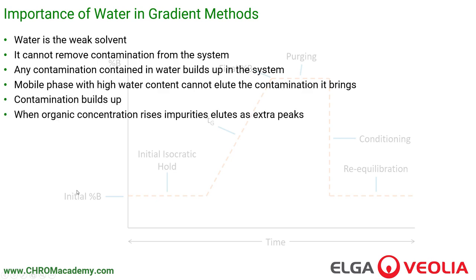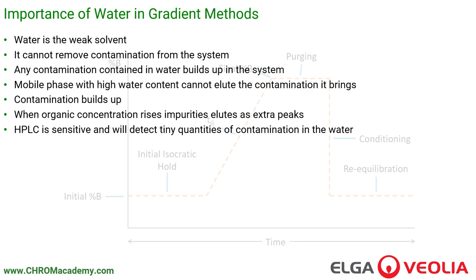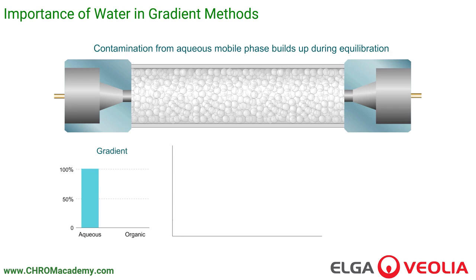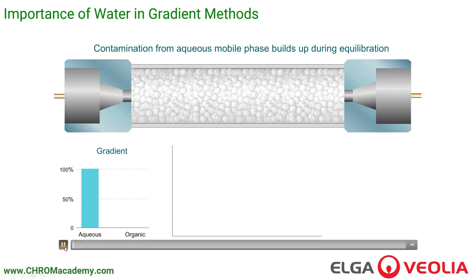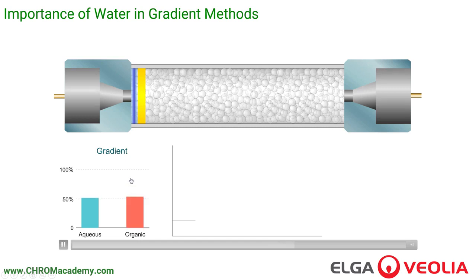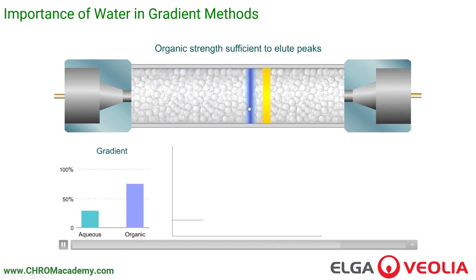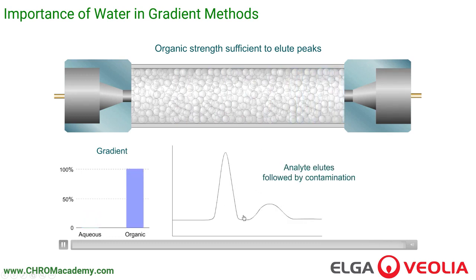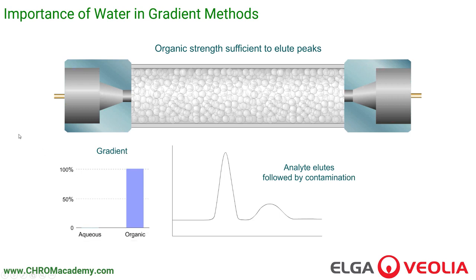When the organic concentration rises, the impurities start to elute as peaks. HPLC is very sensitive and it will detect tiny quantities of contamination in water. What happens is that the water constantly elutes through with the gradient, and as the organic concentration comes up we eventually reach a critical point where the contamination brought on by the water elutes. We then get these huge peaks that appear in our chromatogram, which interfere with the substances we're interested in.